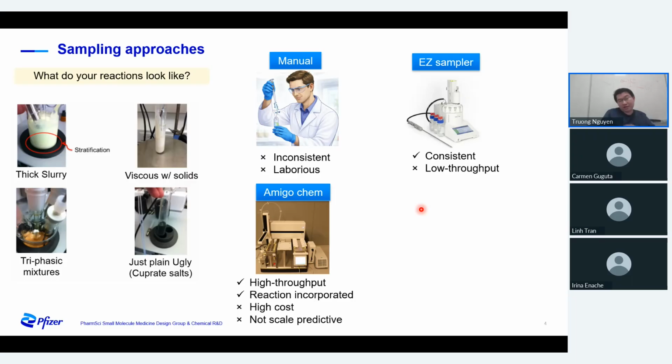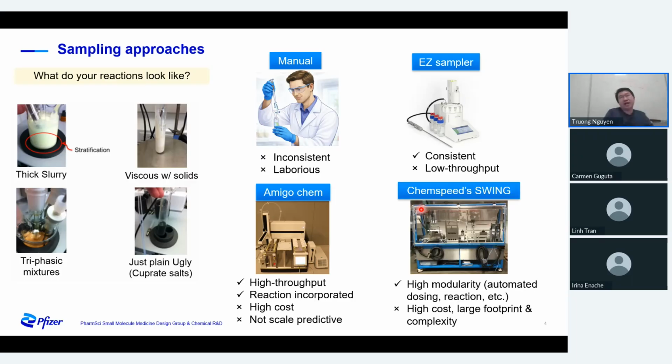At the high end of these technologies, we have some commercially available platforms that can automate the dosing of liquids and solids in an inert atmosphere, like Chemspeed.